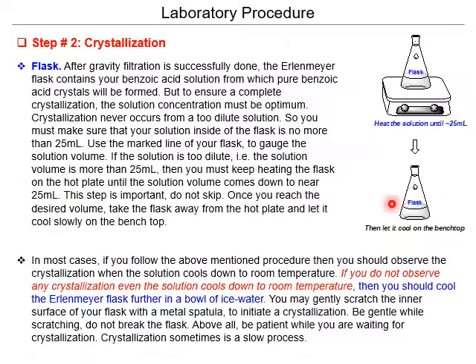After that, you need to do the crystallization step. After gravity filtration, which removed the insoluble impurities, you're going to do your crystallization to have the benzoic acid crystals.